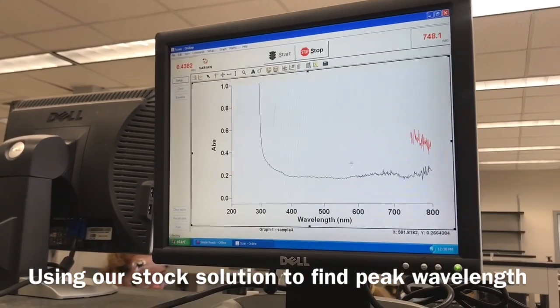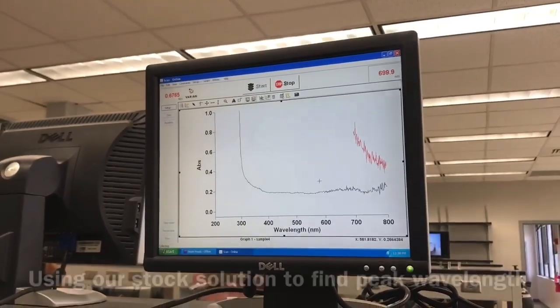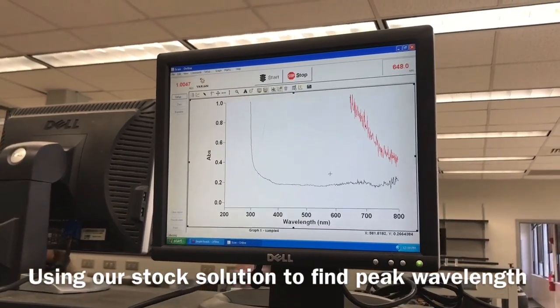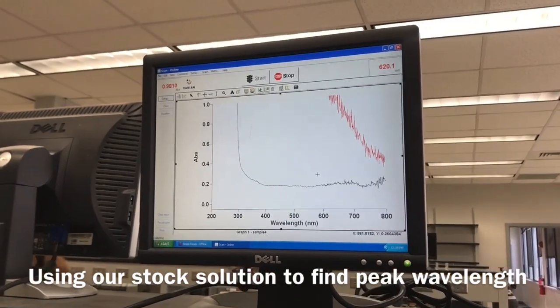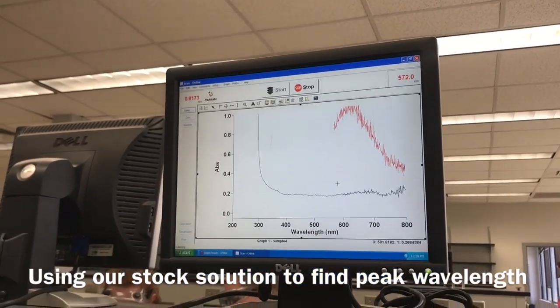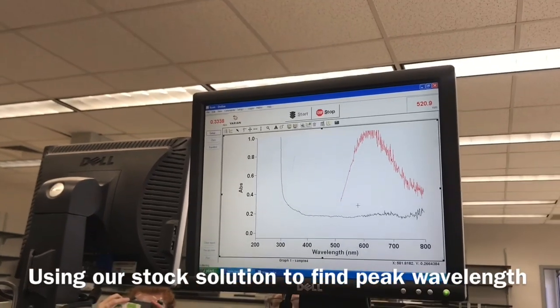A broader range of wavelengths can also allow you to determine the purity of a substance. Two lambda maxes can correlate to two components of one mixture. Lambda max refers to the wavelength along the absorption spectrum where a substance has its strongest photon absorption. You can use lambda max as a parameter to compare different qualities of all types of molecules and substances.